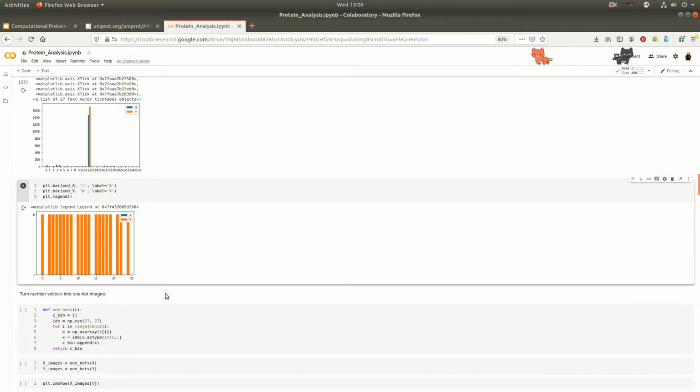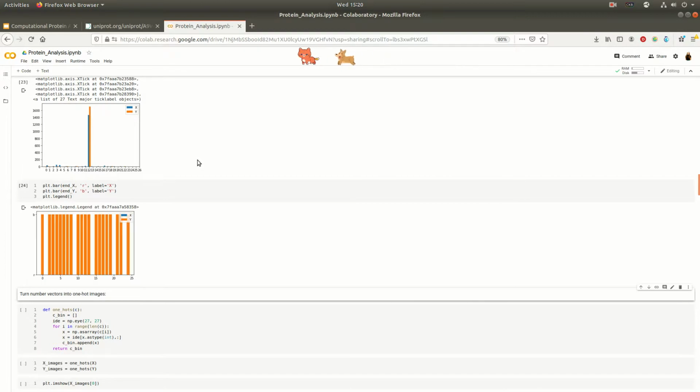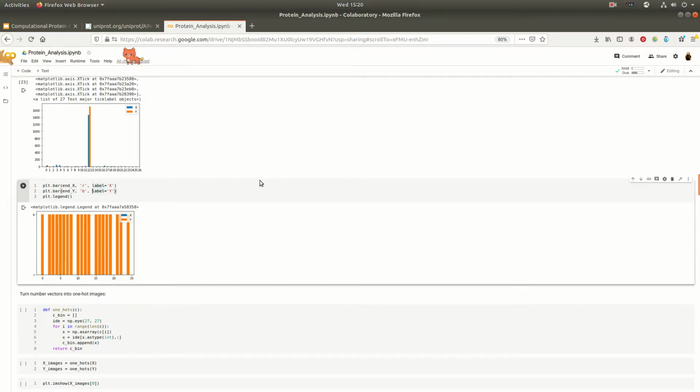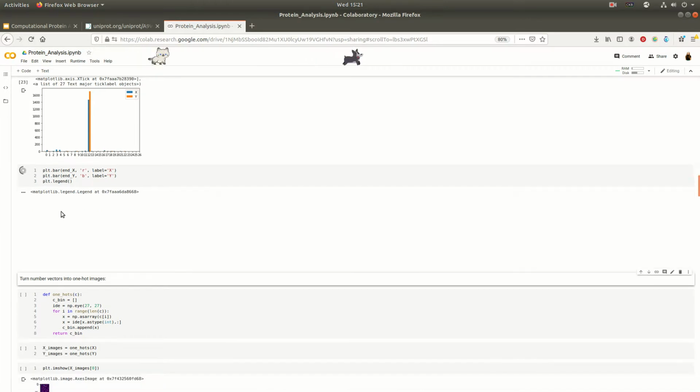Now we can do the same thing for the ending, which is going to be a lot more variable, as we can see here. If you ever want to comment out a line, you can just hashtag it and it'll show you this stuff. Anyways, you could see how this technique would be useful, right? There's a little bit of a glitch in there. We're not going to worry about it.